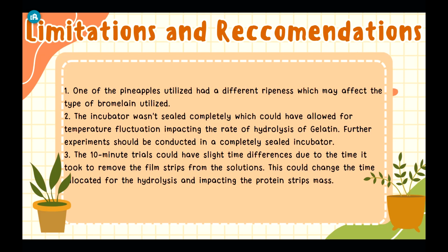The incubator wasn't sealed completely, which would have allowed for temperature fluctuation, impacting the rate of hydrolysis of gelatin. Further experiments should be conducted in a completely sealed incubator. The 10-minute trials could have slight time differences due to the time it took to remove the film strips from the solutions. This could change the time allocated for hydrolysis and impact the protein strip's mass.